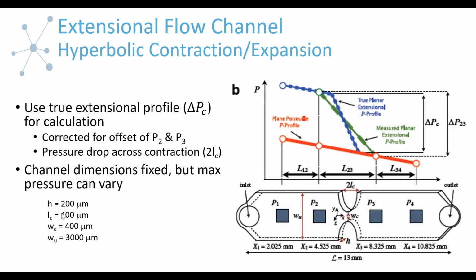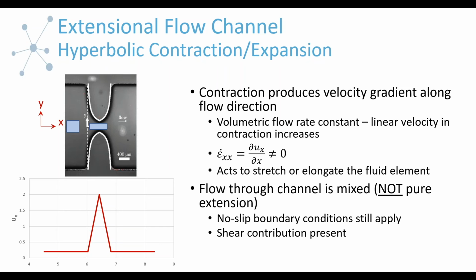And there are various arguments as to why this is. So if you want to contact us, I'll make a note of your question, and I can send you some references where people have measured in the extensional flow channel. But it is very common that it is much higher than other types of measurements.